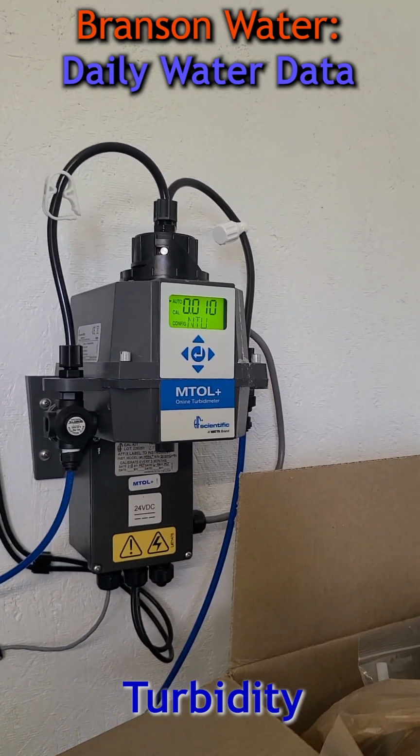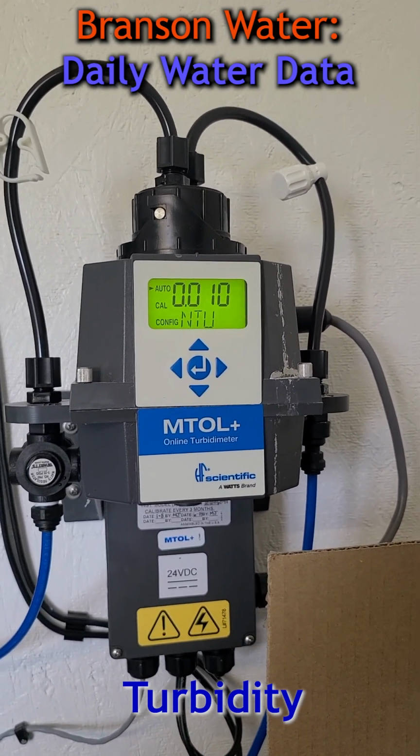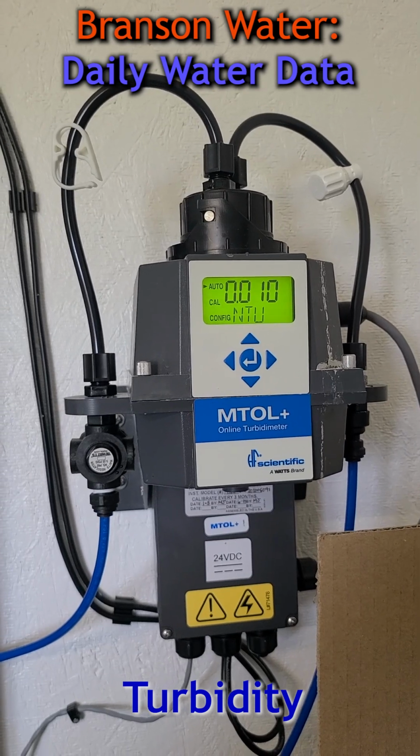The next piece of data you'll have to record, and this is in person, you can see this on the cameras as well, is the turbidity. Here you can see it as 0.010, so on our daily log we'll just write 0.01. That is very, very clear water.